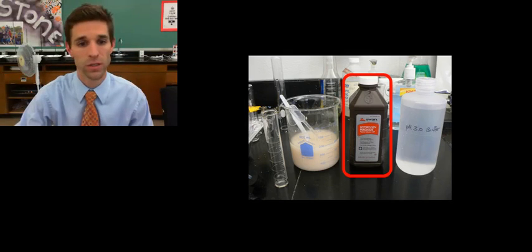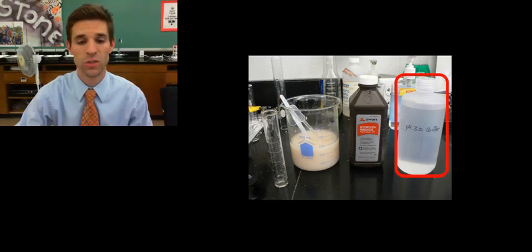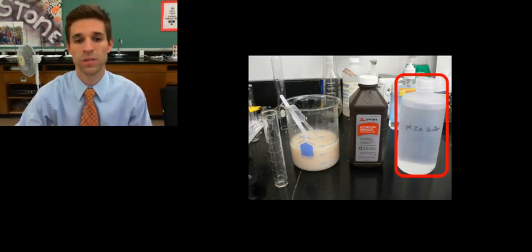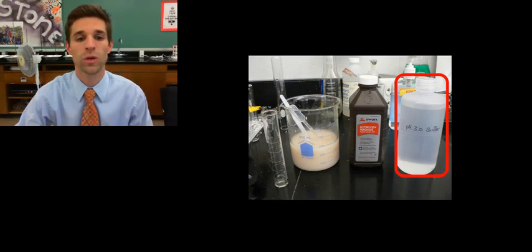And decompose it into the water and oxygen. And then our variable that we're going to be testing is pH. So our question is how does an environment with a different pH affect how the yeast cells and therefore their enzymes actually work to decompose and cause a chemical reaction with the hydrogen peroxide.